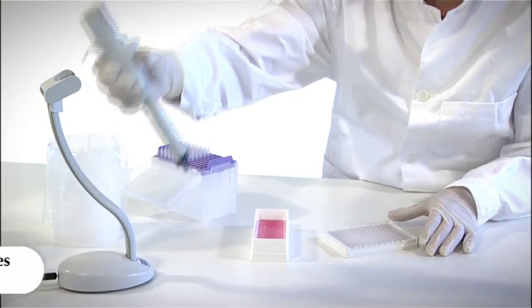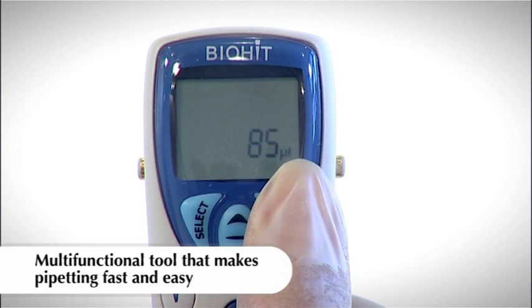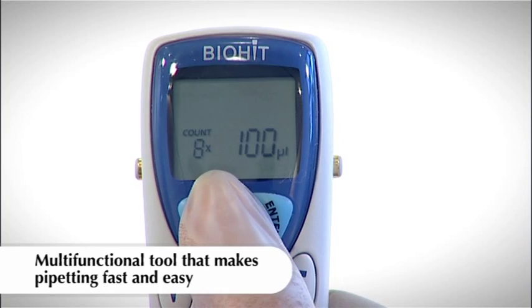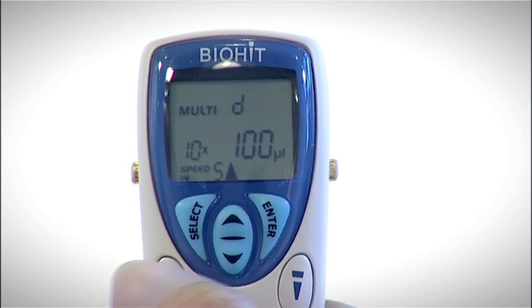E-Line is a real multifunctional tool. The pipette provides 11 different operation modes and 6 storage places for your favorite programs. The pipette is simple to program and makes your work fast and easy.